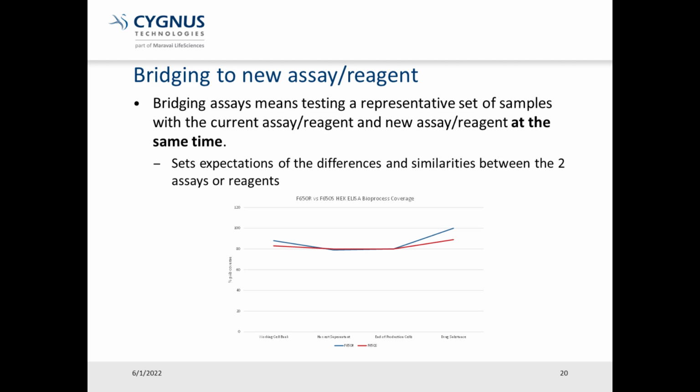I'd also like to take this opportunity to point out that even if the exact same antigen is used to immunize two herds of goats, and the same affinity column is used for purification, there will be differences. In the case of our commercial kits, most companies see very little difference. However, it is not uncommon for HCP results to increase or decrease significantly, sometimes even within the same purification process. In other words, within one purification, some samples may be higher with the new assay, and some samples can be lower than they were in the previous assay.